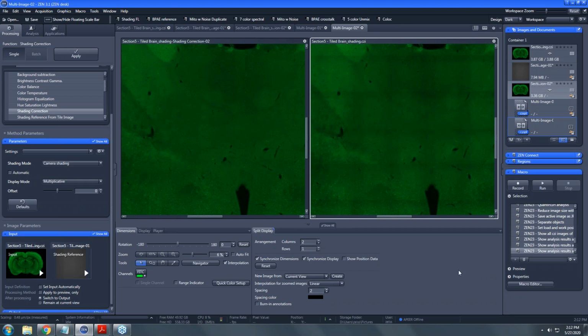Nicole, should we do the colocalization? Sure. What we're starting with is all requests that we had as a result of our last Explore ZEN. Somebody requested shading, and I believe it was fluorescence shading. I hope we covered that. If we didn't cover your question and you know who you are, then please speak up and mention it again. And we did have a number of requests for colocalization. So let's close all these images, Nicole, and open the colocalization image.